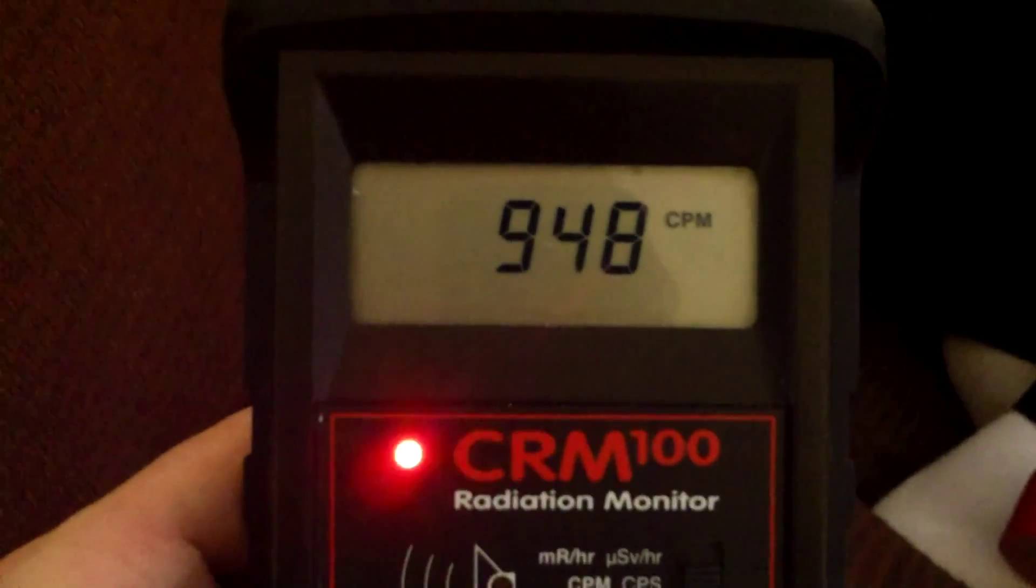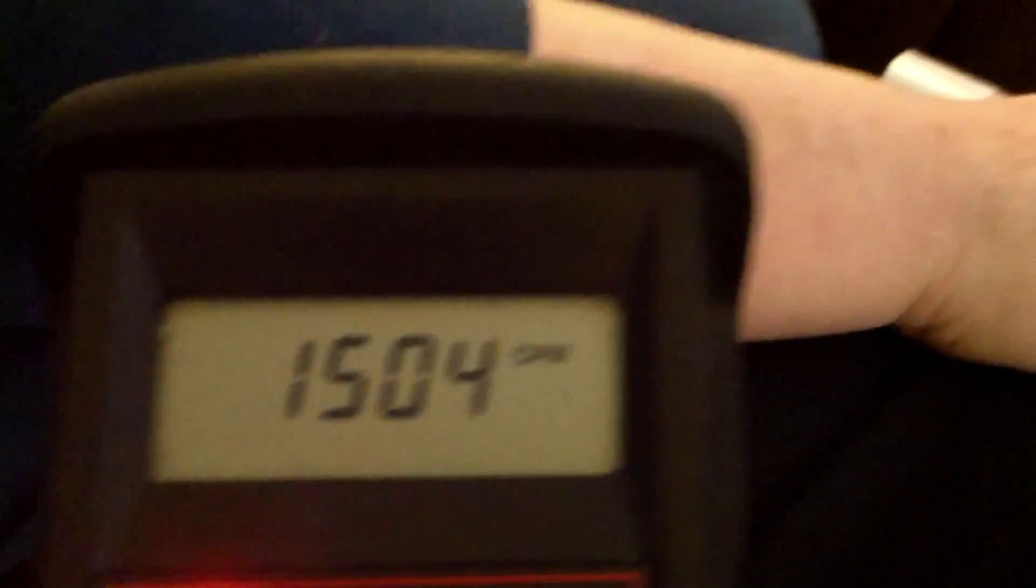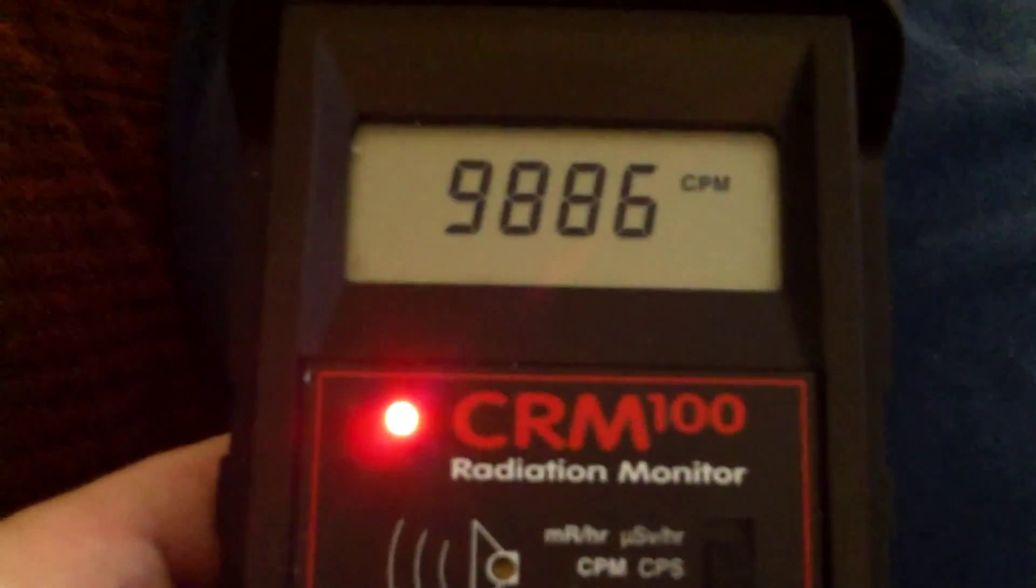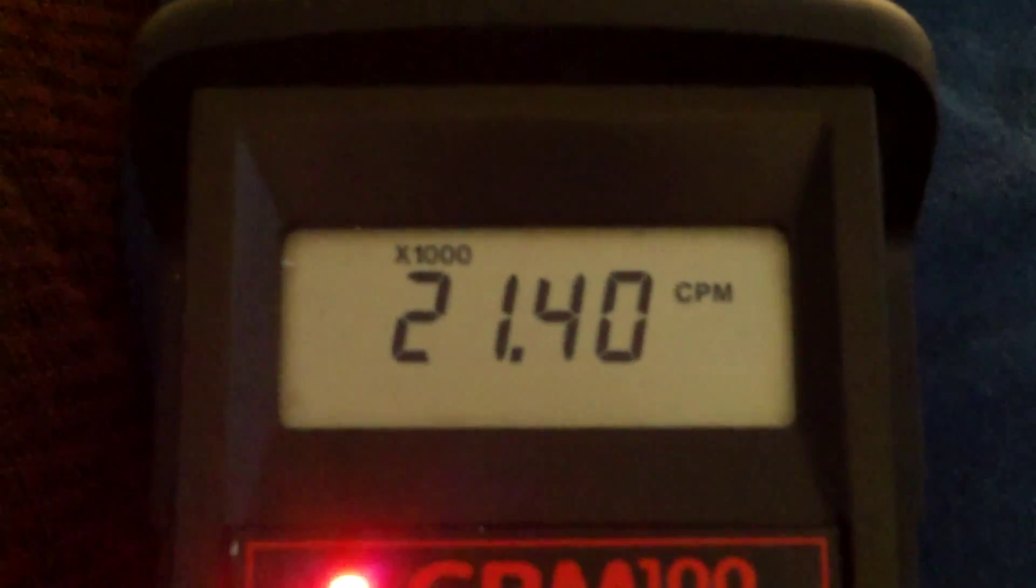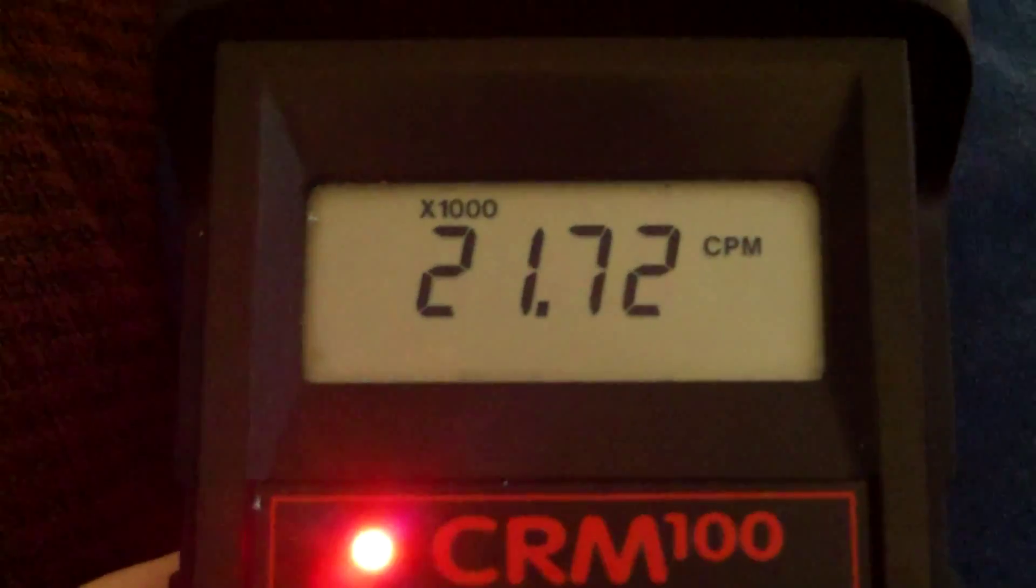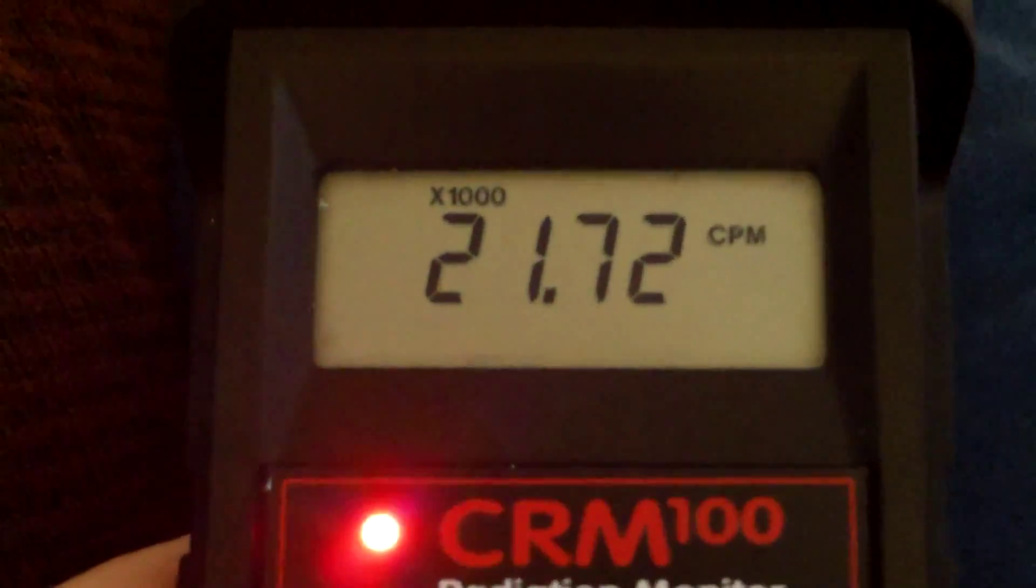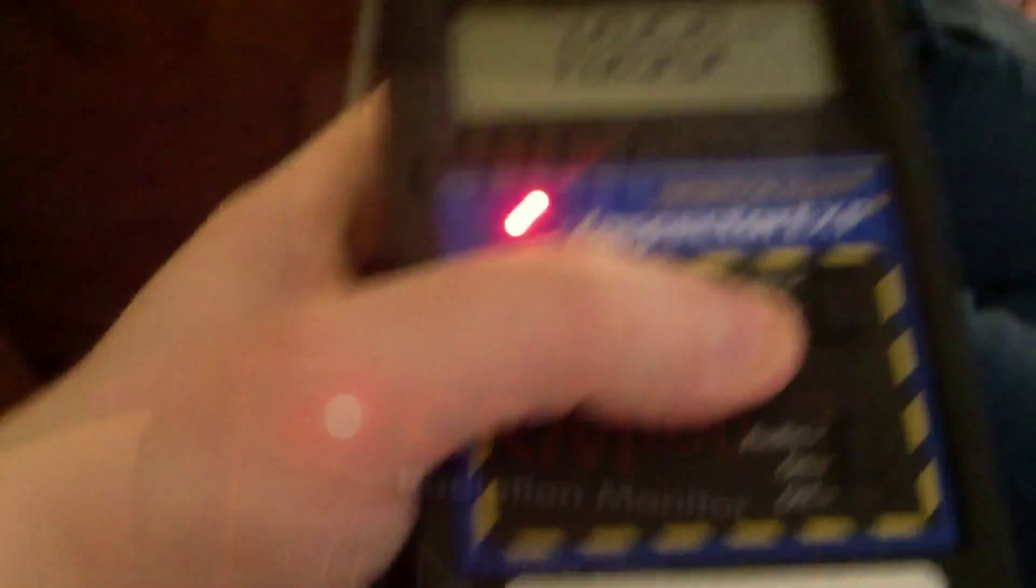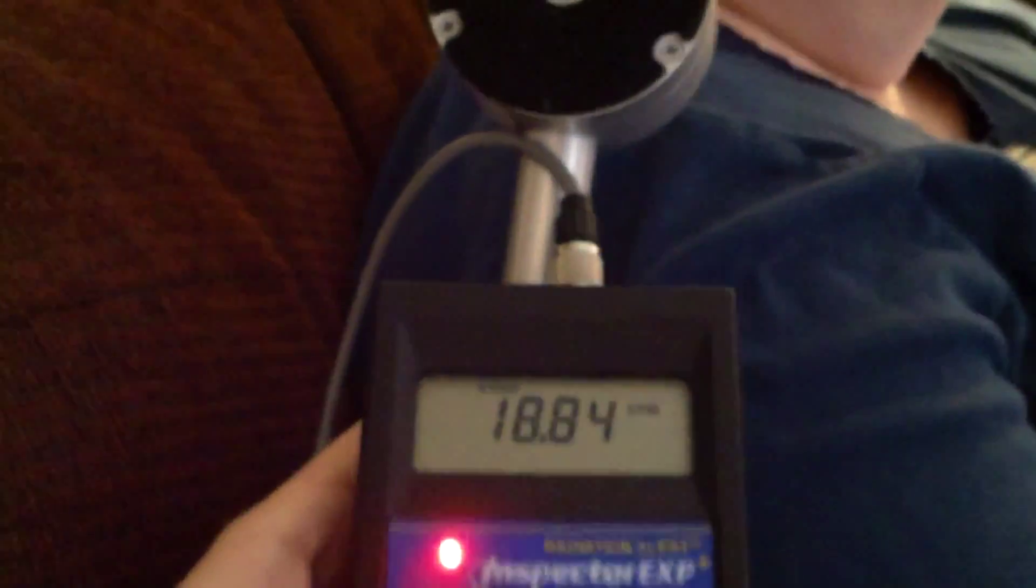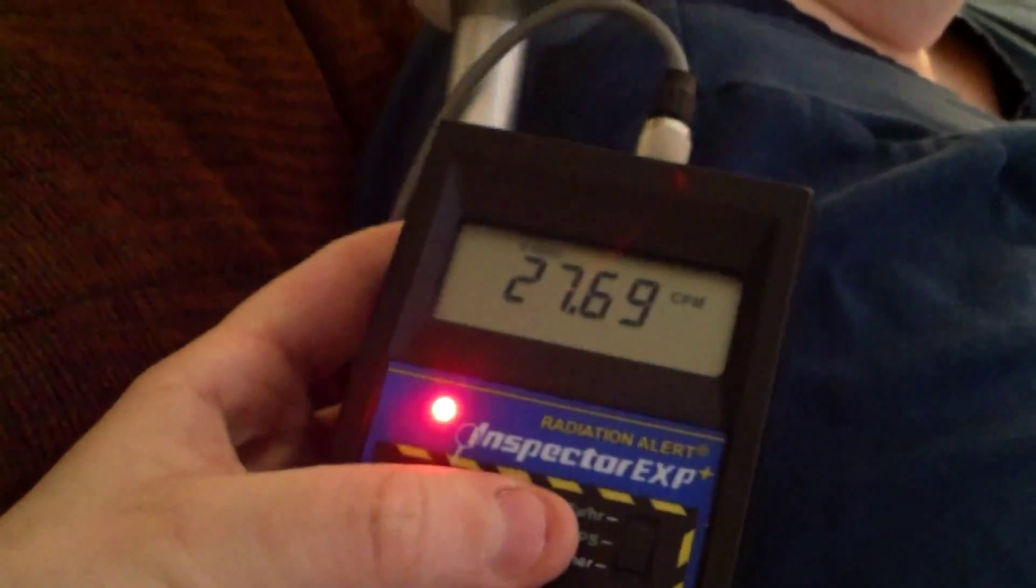I started off with the small CRM-100 which has a very small tube. And here's what it sounds like about 3 or 4 inches away from the person's face. After that, I selected the Inspector EXP Plus. Again, pretty crazy sounding up close, huh?